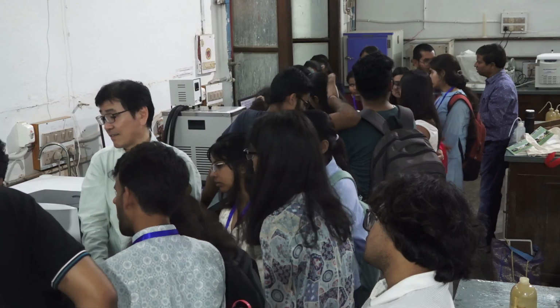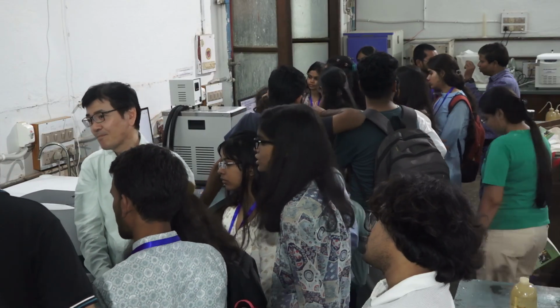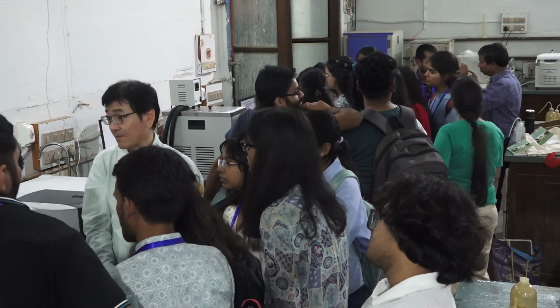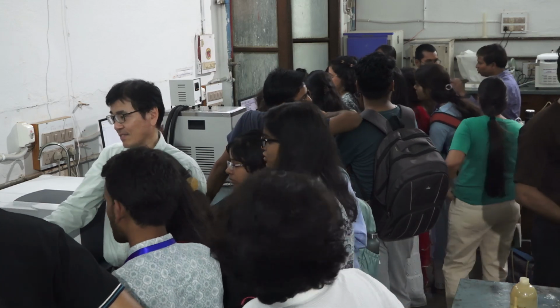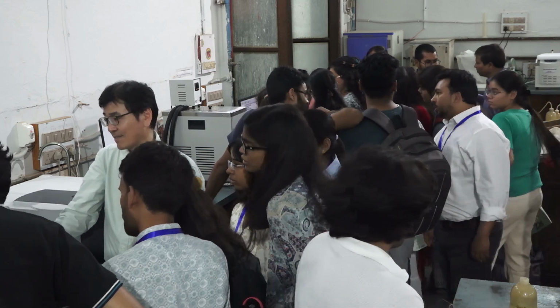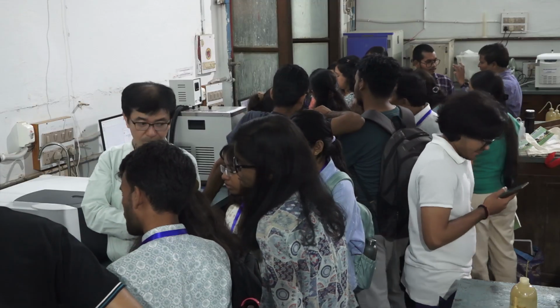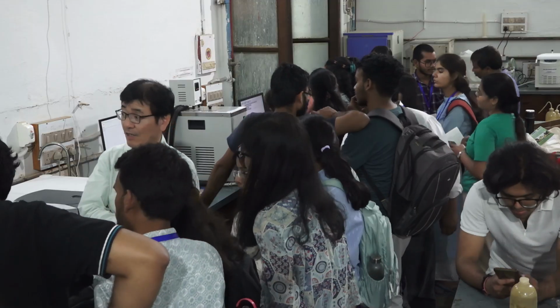Then what is necessary for one measurement? I0 and I, twice. So I0 should be measured at this condition. Without sample, I0 is measured. Then now the measurement is underway.